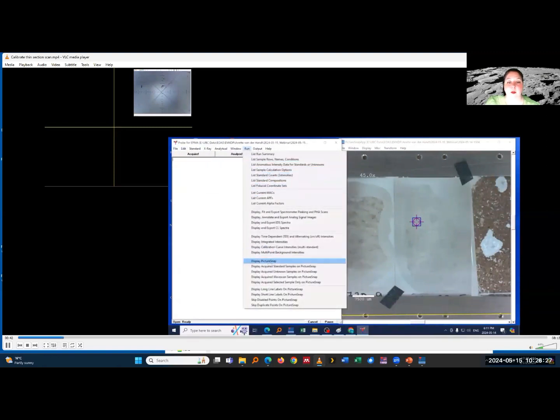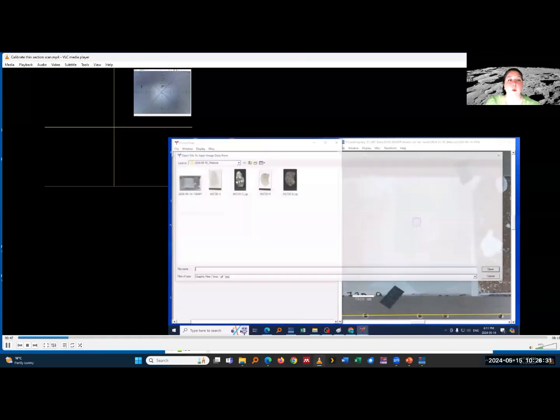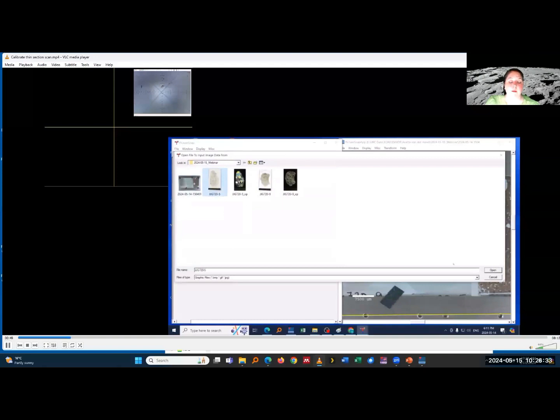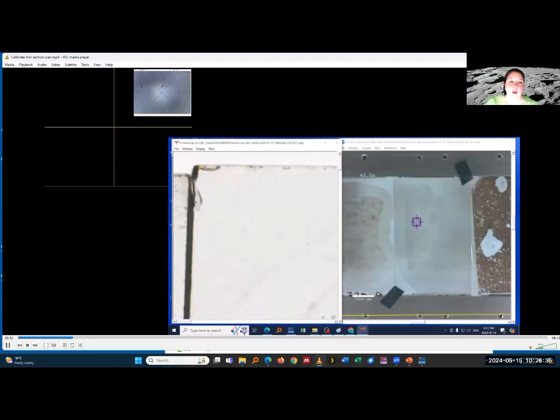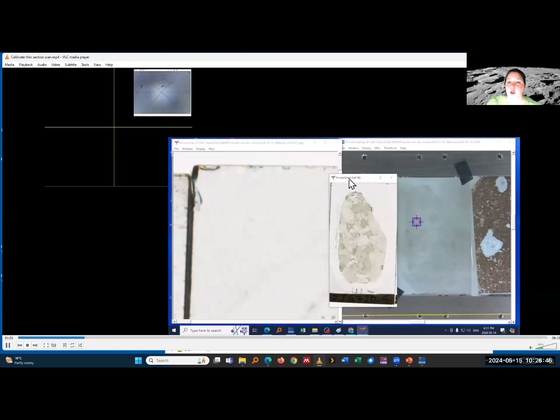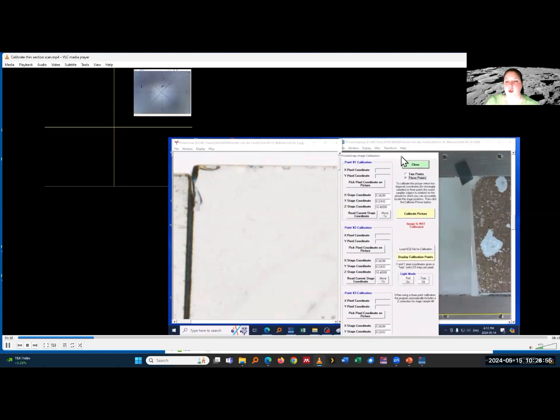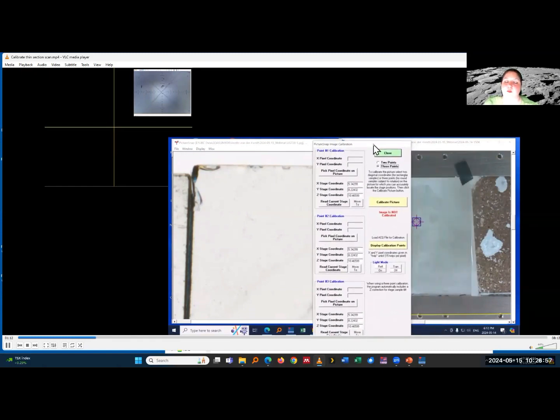I have a project open, and now I open up my thin section scan that I want to calibrate, and it's a very high resolution. So if I want to see the entire thin section, I can open this full image picture viewer. But I like having the high resolution of the thin section scan because that will give me also very clear positioning for my annotations later.